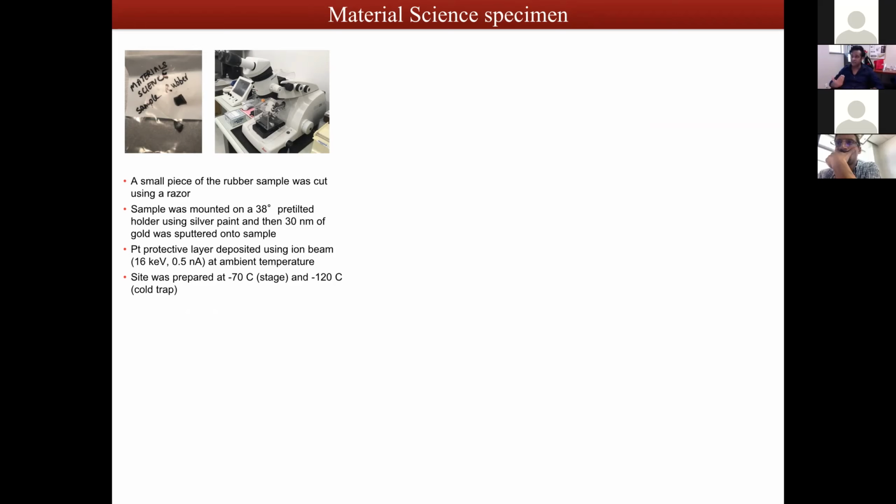So it needs to be pre-cooled at a given temperature, but rubber doesn't like to be cooled at, say, -170 degrees centigrade. The optimum temperature for that is around minus 65 to minus 85 degrees centigrade. I'm not going to be speaking in detail about the method. It is just jotted down in 4 simple points.